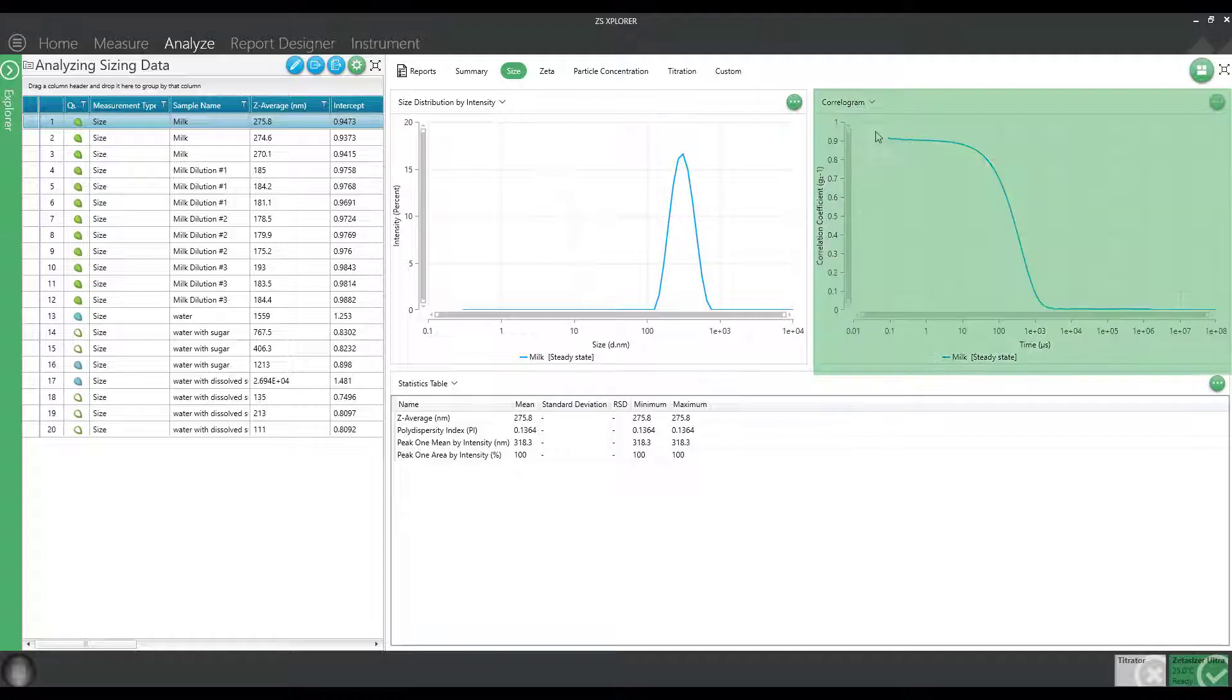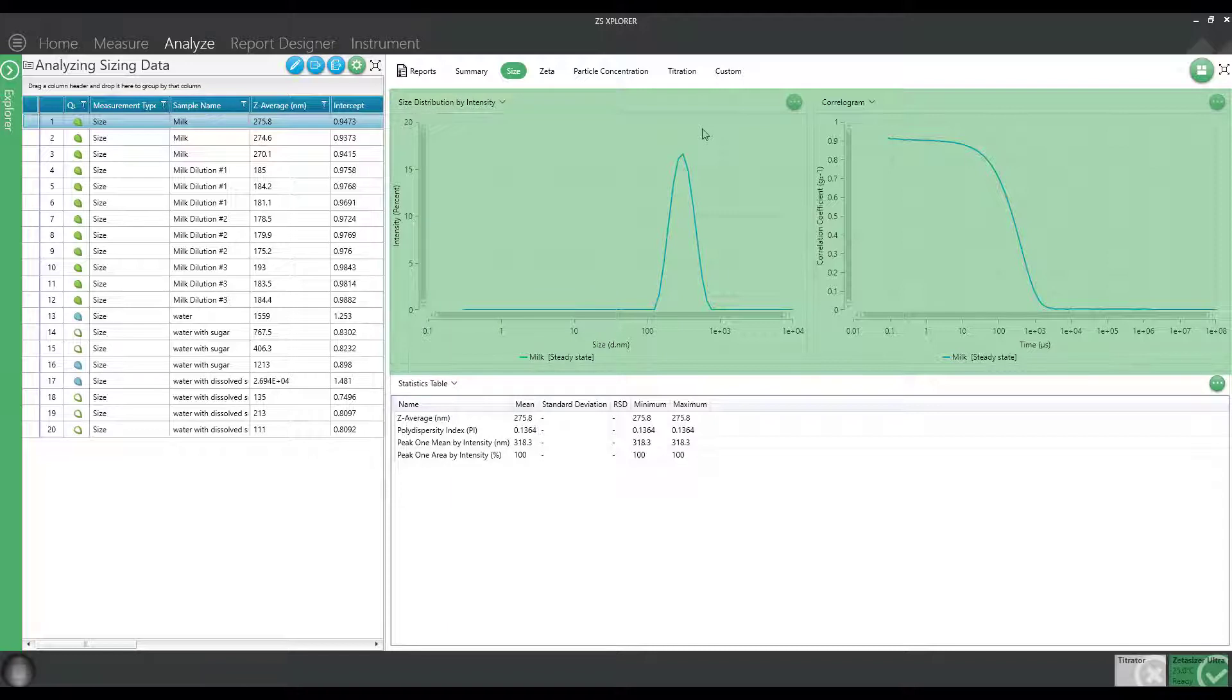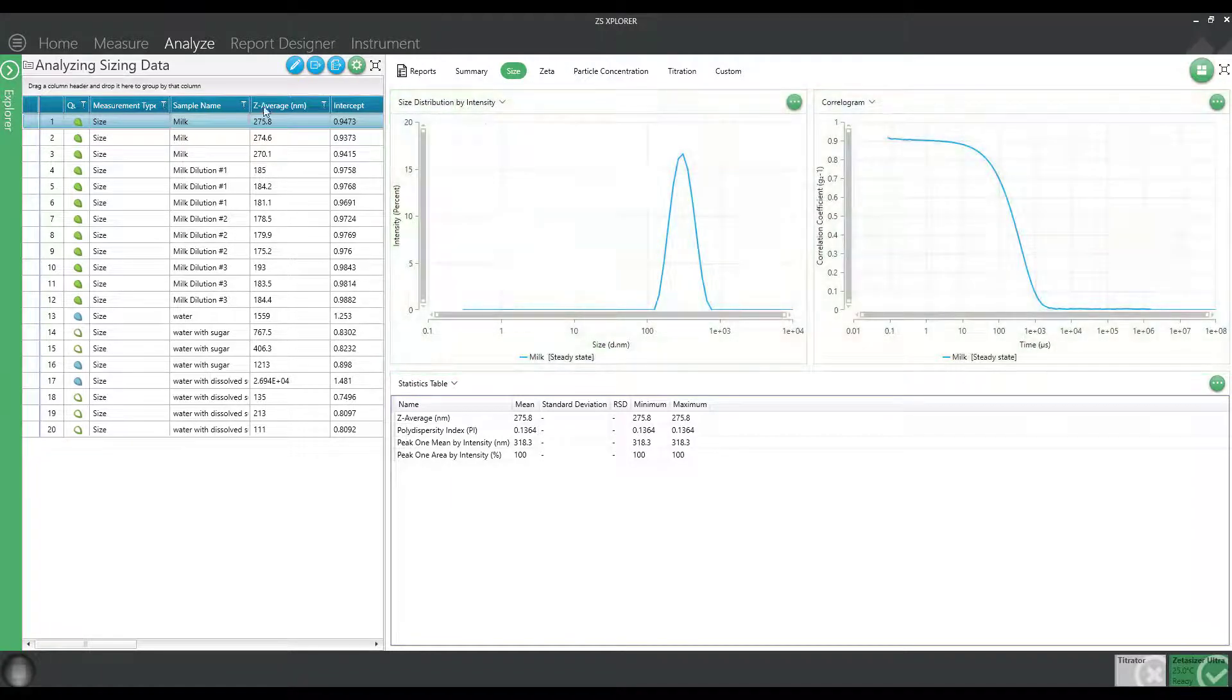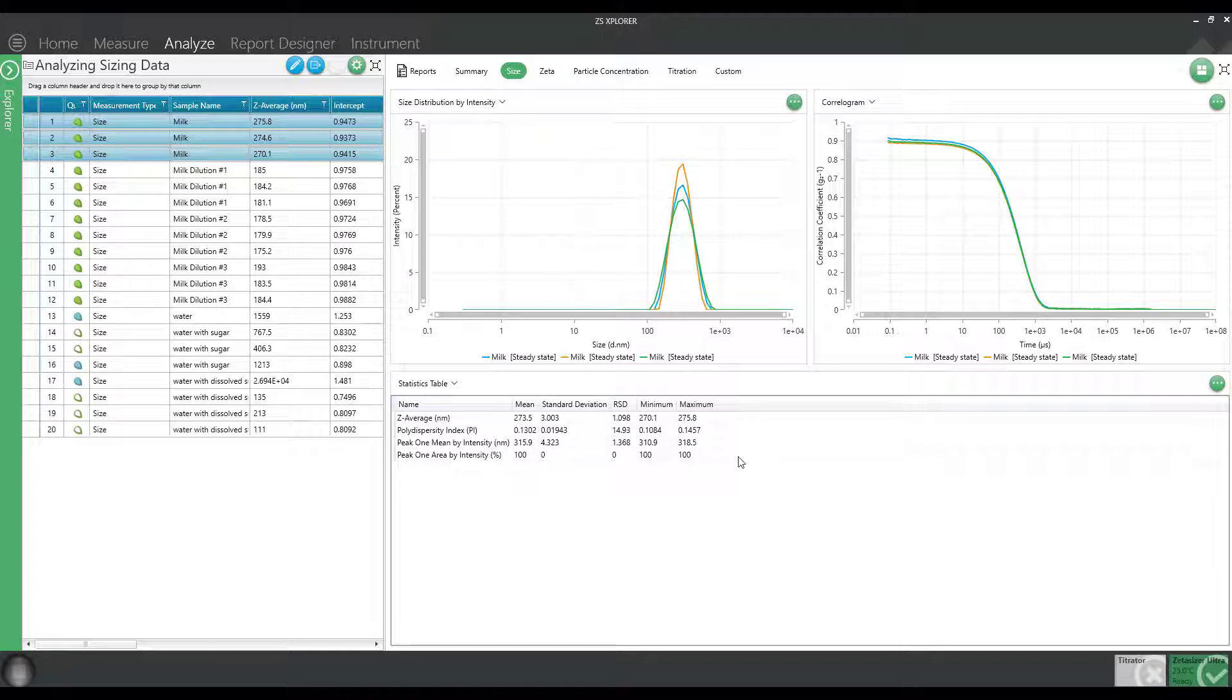You can look at the correlation function and the intensity distribution, which looks like a pretty good result. We even ran this triplicate to see if we get consistency across triplicate measurements, which in this case, it looks like a pretty good measurement.